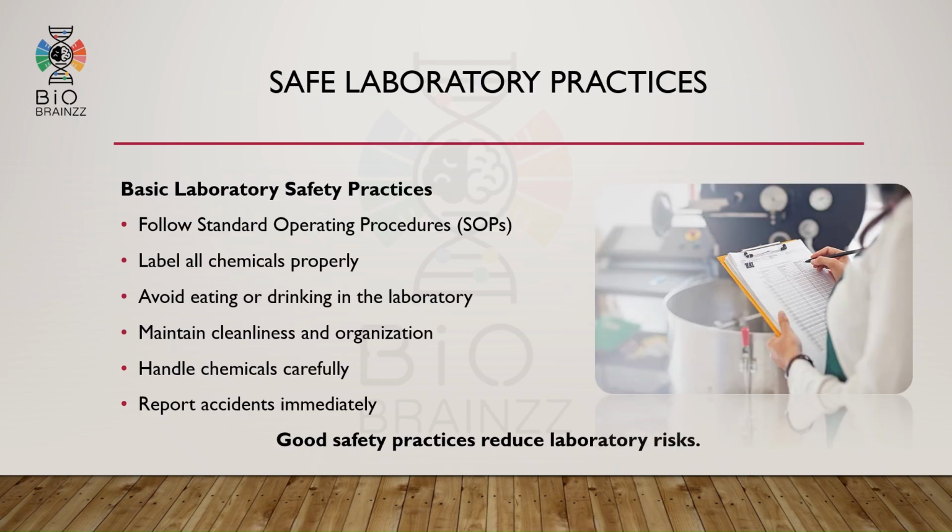Safe laboratory practices are daily habits that help maintain safety. For example, following SOPs properly, labeling chemicals correctly, maintaining cleanliness, avoiding food and drinks inside laboratories, and reporting accidents immediately. These practices may look simple, but they greatly reduce laboratory risk.